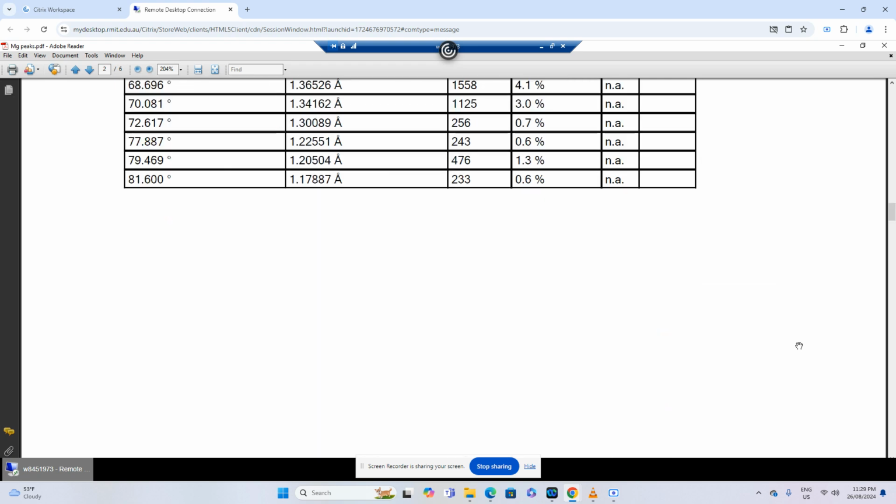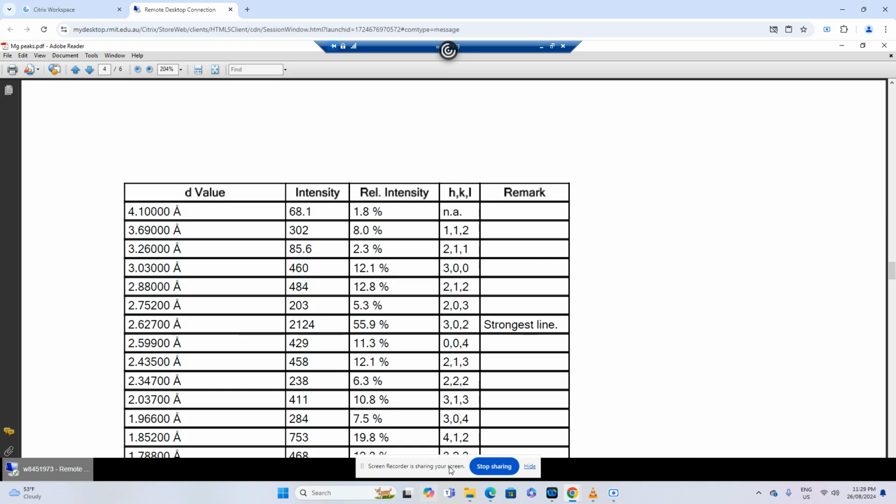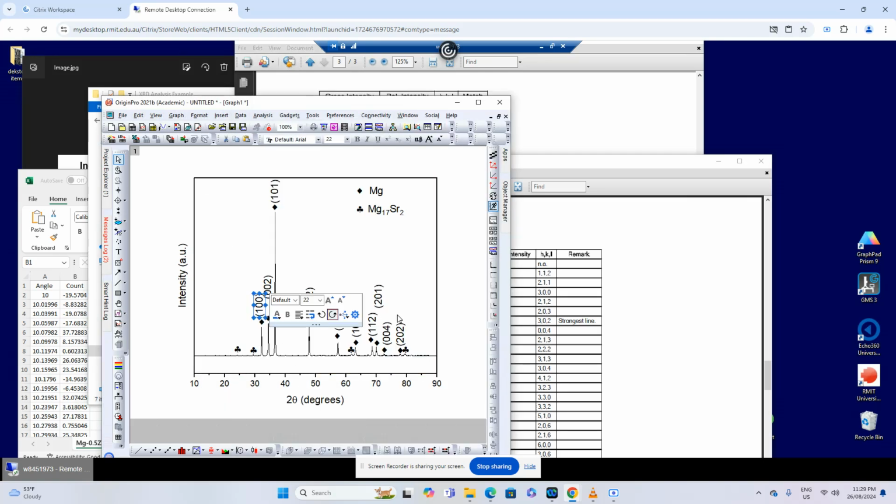Yeah, for the first peak I do not have it, but for the second peak it recorded a value of 112. So I can just put it there, 112. So what we actually do with the XRD, we try to provide maximum information about the phases. Number one, the most important information: which phase, at what angle.